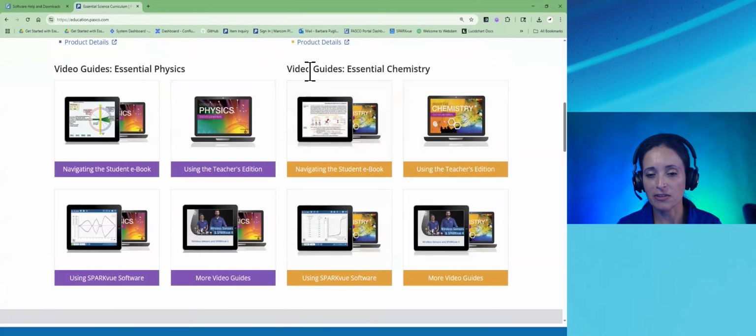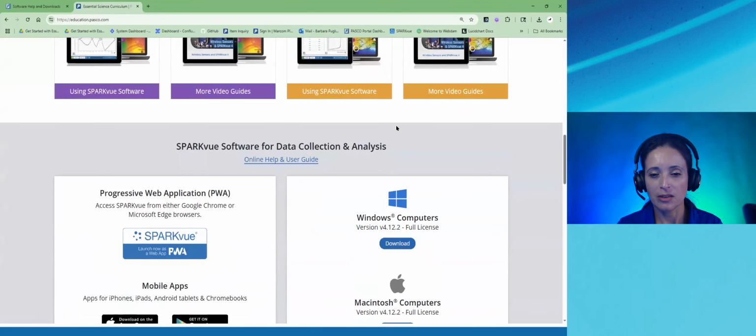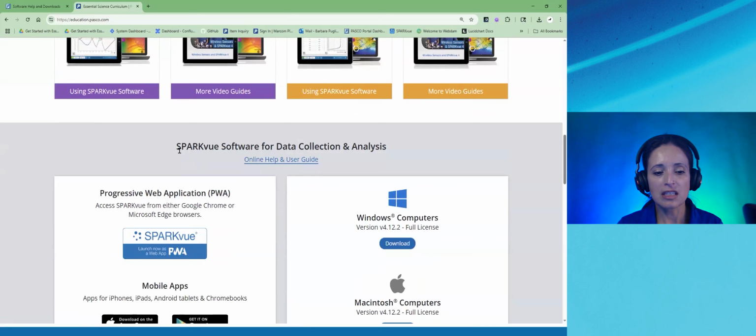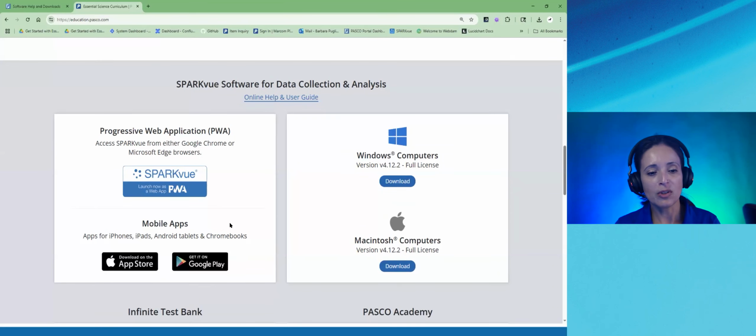By the way, there are some nice video guides here to help you with using SPARKvue software. It's available to students and teachers. Then there's a section that says SPARKvue software for data collection and analysis. So you can use SPARKvue from your browser at sparkvue.pasco.com. I put that in the chat earlier, but I'm going to put it in the chat again.